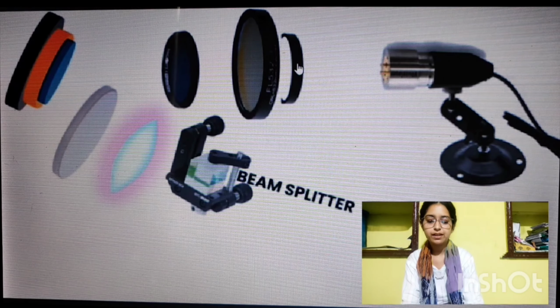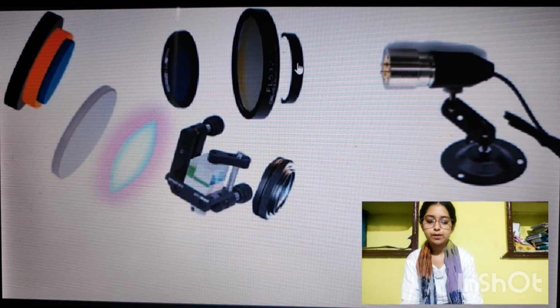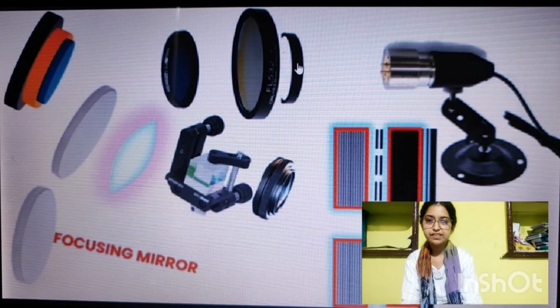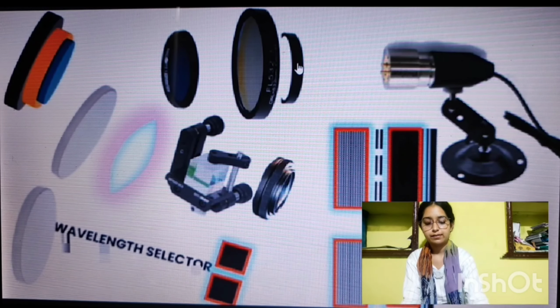So the mirror reflects the laser light toward the sample while allowing Raman scattered light to pass through, ensuring that only the desired wavelength laser line reaches the sample and Rayleigh scattering light is suppressed. Then the focused laser beam interacts with the sample. So Raman scattering occurs, generating both the Stokes and anti-Stokes lines.